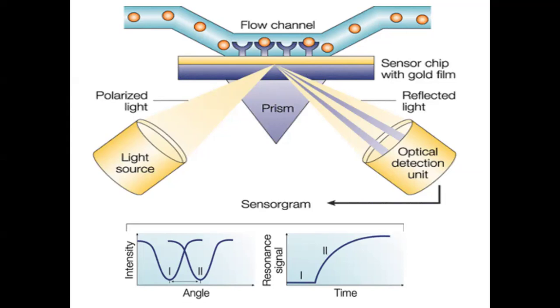The principle of this SPR is to be clear for you to synthesize any sensors or for use in any other material formation too. Here you can see this is a flow channel, because usually your analyte, which has the antigen or the antibody or any enzymes, will be coated in a kind of microfluidic channel.